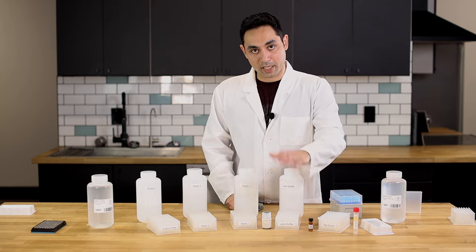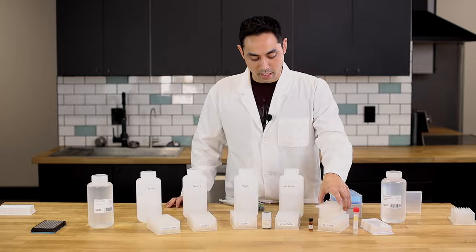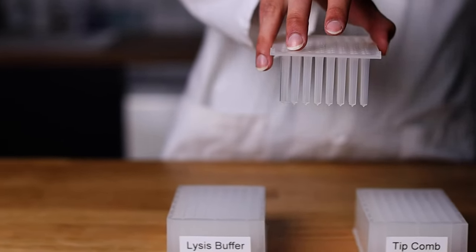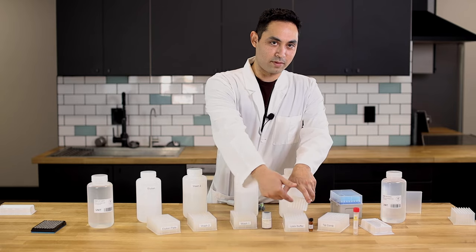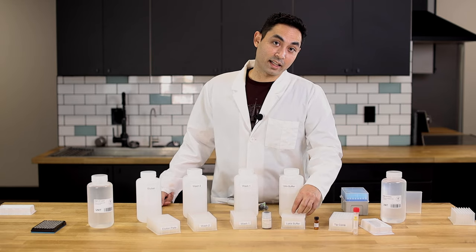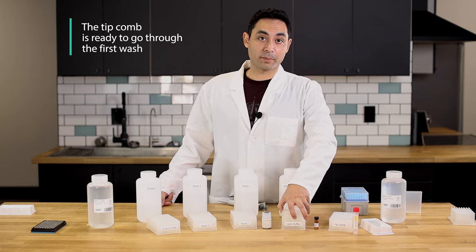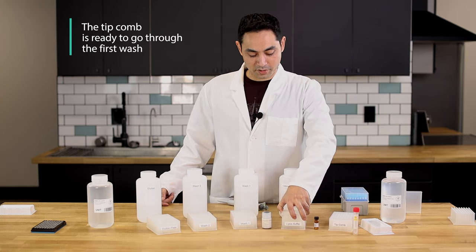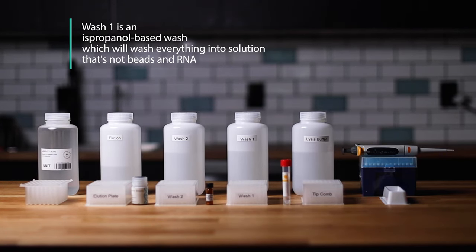After the lysis buffer does its job, you want to pick up the magnetic beads with the tip comb. So the tip comb is gonna come over, the machine is gonna grab it, and it's gonna mix it. The beads are gonna stick there. Now that everything is lysed and the magnetic beads with the RNA are on the tip combs, the tip combs go over to the first wash — the isopropanol-based wash — which is gonna wash everything into solution that's not beads and RNA.